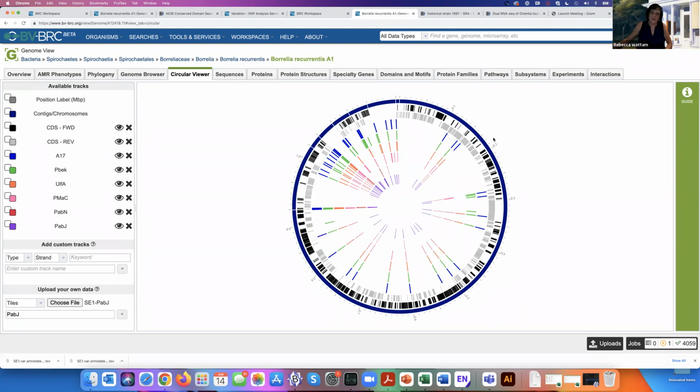Like some of them are, come here you. This is something unique to this guy, and it's telling you the exact location that I manipulated, but it's still the general area where that SNP occurred.